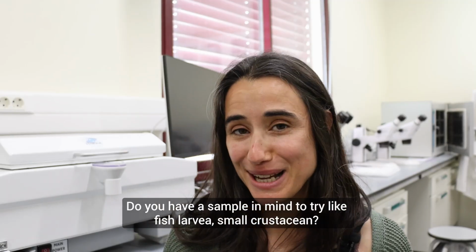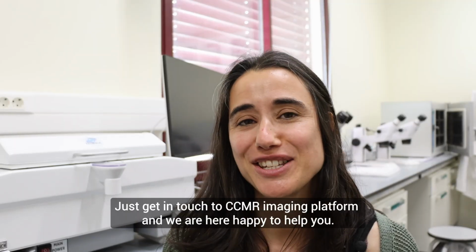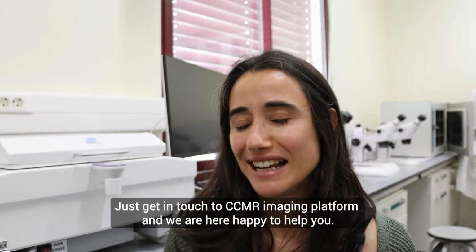Do you have a sample in mind to try, like fish larvae, small crustaceans? Just get in touch with the CCMAR imaging platform, and we are happy to help.